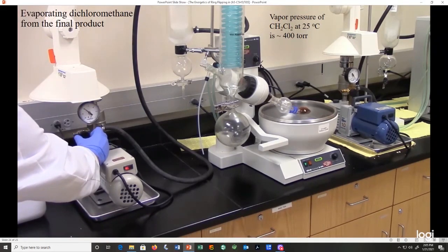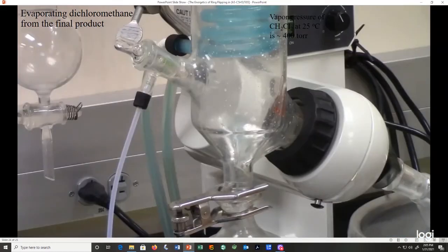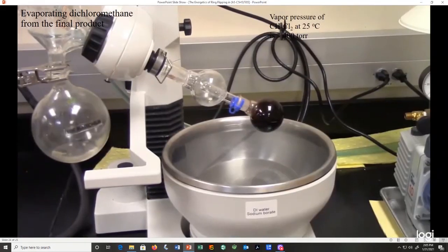We're getting our evaporation and our condensation. And when we cease to get any more condensation from our cold finger, we're done and we can retrieve our product.